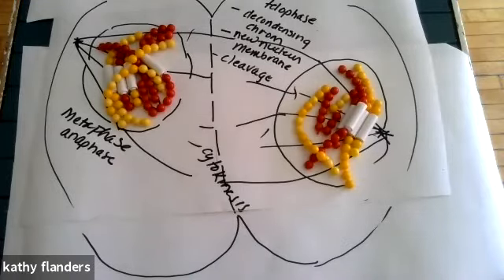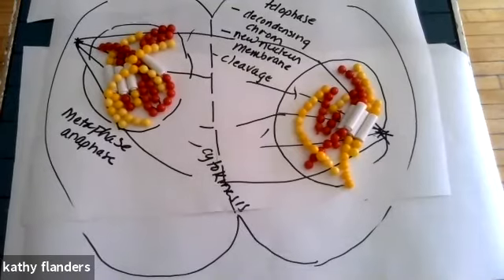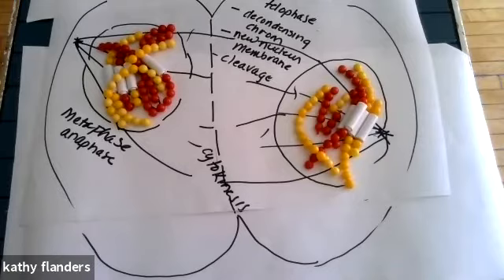So you're seeing the various stages, you're seeing the decondensing of the chromosomes. So when you go to look at the virtual microscope, you'll see variations of each of these. All right. And now you know why. What you're actually seeing is those chromosomes.